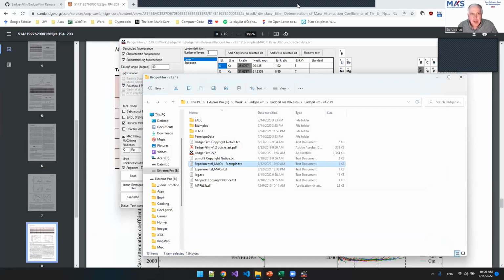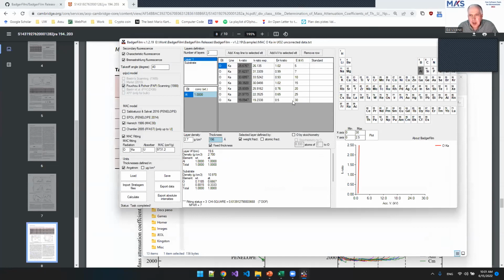Thank you very much, Aurelian. Very interesting stuff. In general, if people are asking about how many different voltages should I use to collect the data, do you have a general rule of thumb to give them? I will say at least 3.